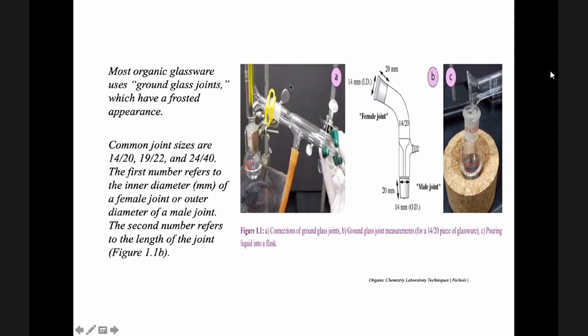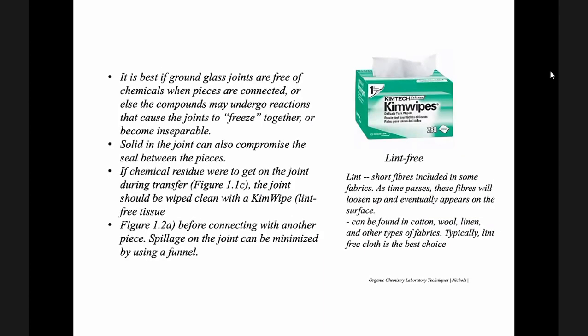Now, sometimes, especially after the experiment, budlayan kamo ni magkuha sa joints, nag-get siya na-fix. So, what will you do? Okay, so here, it is best if ground glass joints are free of chemicals when pieces are connected, or else the compounds may undergo reactions that cause the joints to freeze together or become inseparable. Okay?